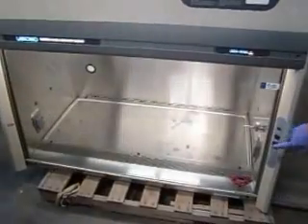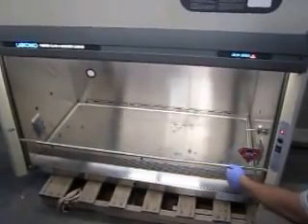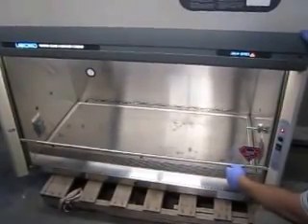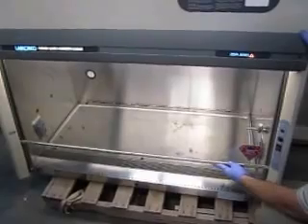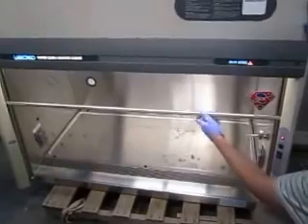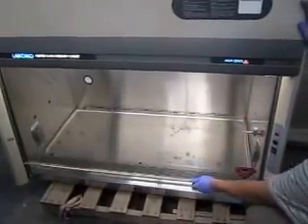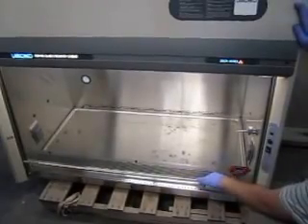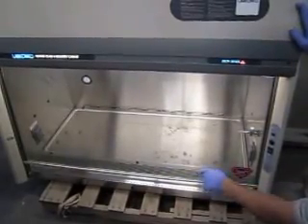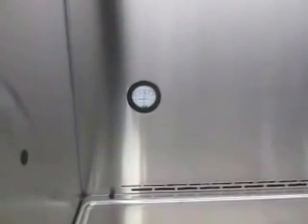This is our bio-safety cabinet. You can see the fans work just fine. The alarm works when it's raised past this level. And there's a gauge in the back that shows some kind of pressure there that you can see.